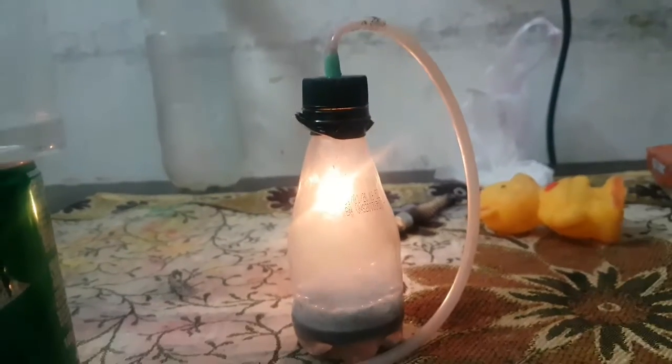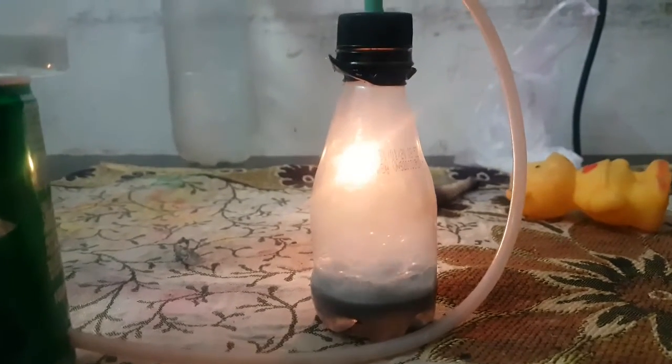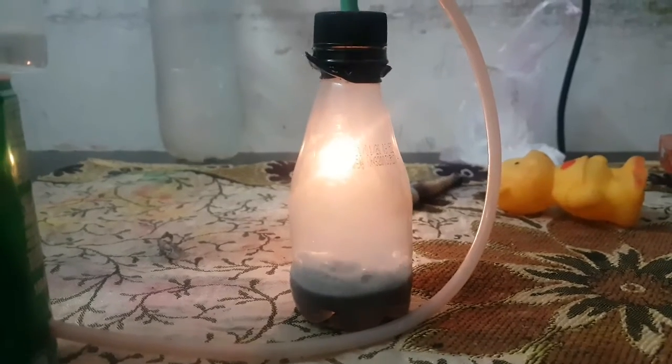What are these two things? These things are sodium carbonate, sodium hydroxide, water, and aluminum foil.